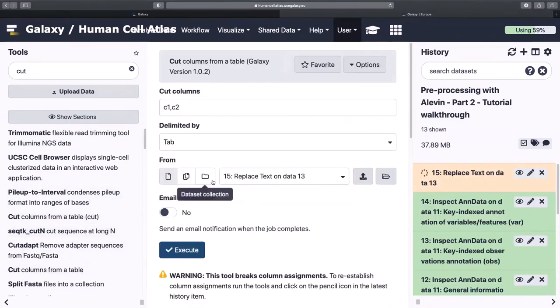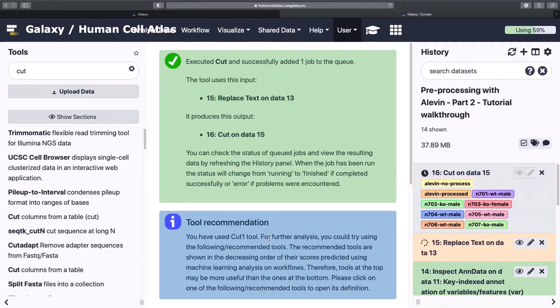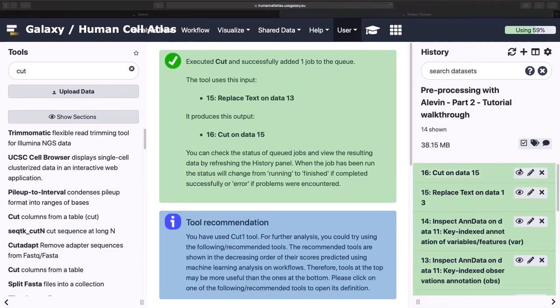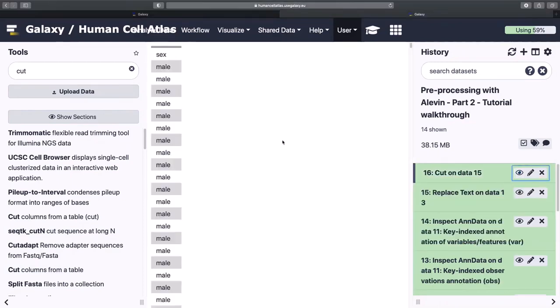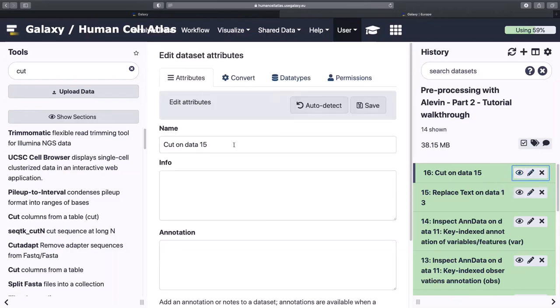And we only want those columns, rather than, if we look at this, what we're interested in is creating a lovely column that's useful here. We don't want to repeat all of this extra information, so let's cut it. Don't want advanced cut. All we want is c9. And then this should give us, yes, our column of sex metadata.